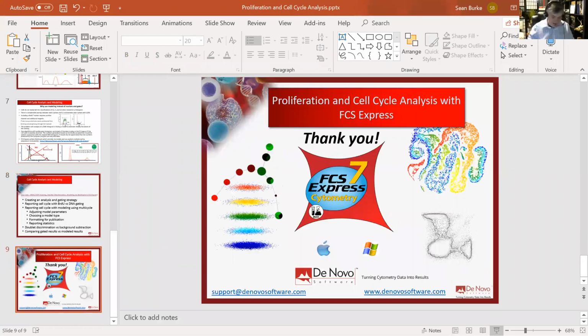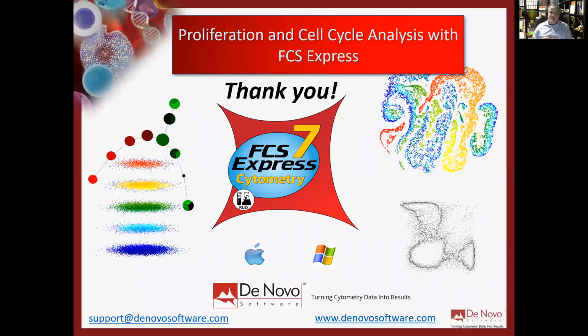We do have a lot of resources on the De Novo Software website: written tutorials, video tutorials, and we provide sample data. In fact, we provide all the sample data that I worked with here today if you want to go in and start analyzing some of that.